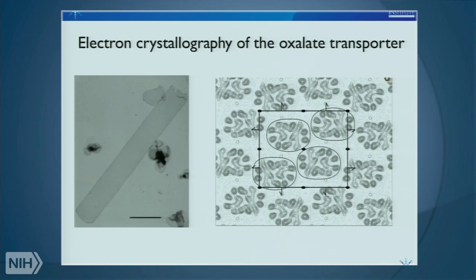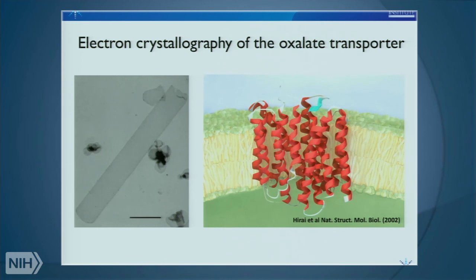And in 2002, we demonstrated that we could actually obtain structures of this protein at, at that time, very low resolution, about 6 angstrom. But nevertheless, in combination with work that Ron Kaback had done around that time, we could derive mechanistic insights into the way in which these transporters worked. And over the years, the last decade or so, there are now many, many high-resolution structures. And fundamentally, this mode of action seems to be conserved in transporters in this family.